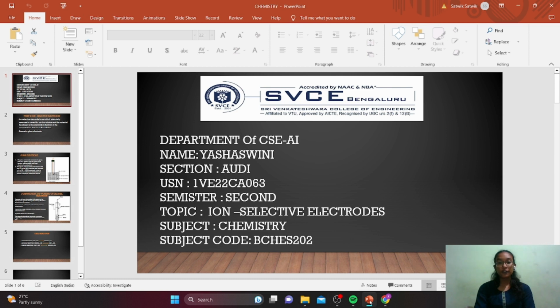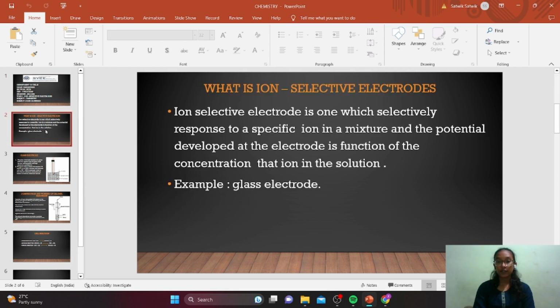So today I'm in front of you to speak on the topic ion selective electrode. So let's start. Let's see first what is an ion selective electrode.